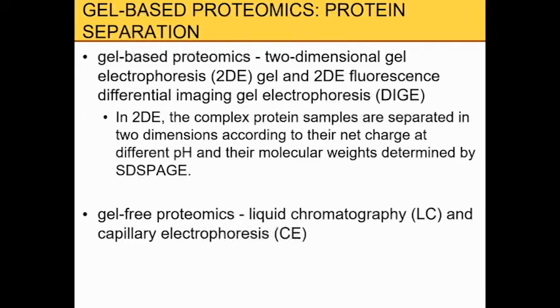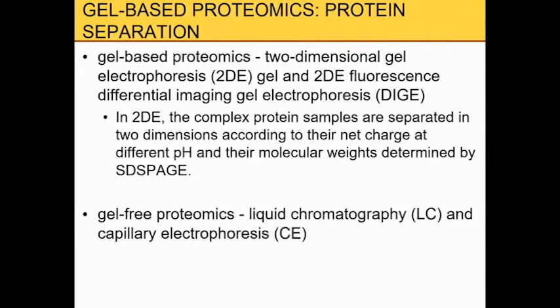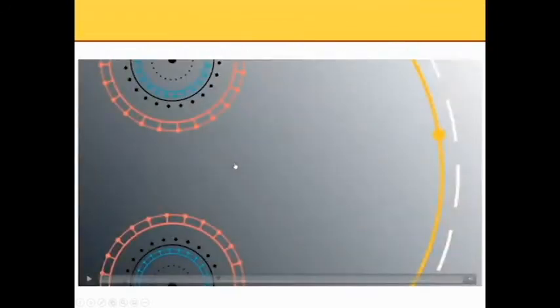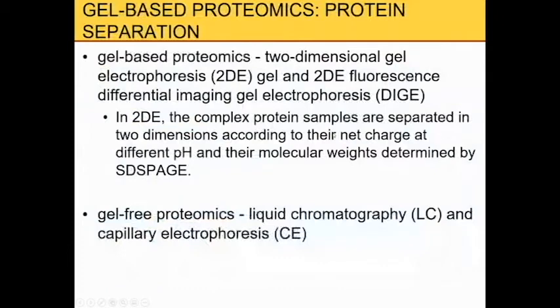Okay, and currently proteomics has been dominated by this two-dimensional gel electrophoresis coupled with mass spec, right? And it's a very powerful technique to evaluate and analyze the protein. So for the two-dimensional gel electrophoresis, as we know, one of the dimensions would be the regular, standard protein gel electrophoresis. That's the SDS-PAGE gel. That's based on the size, okay, based on the size.